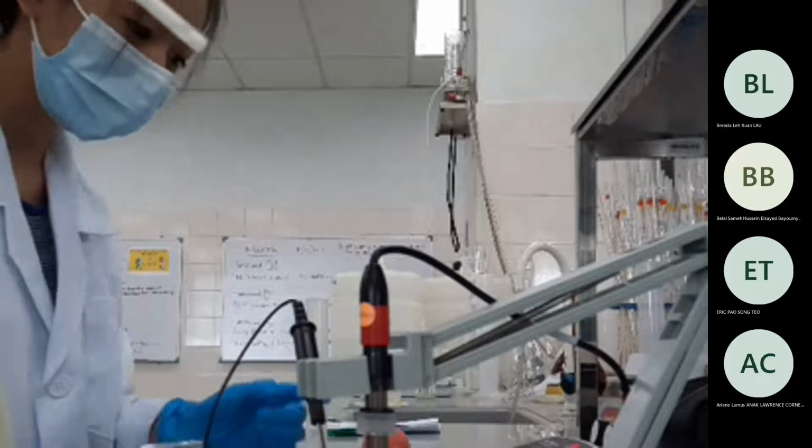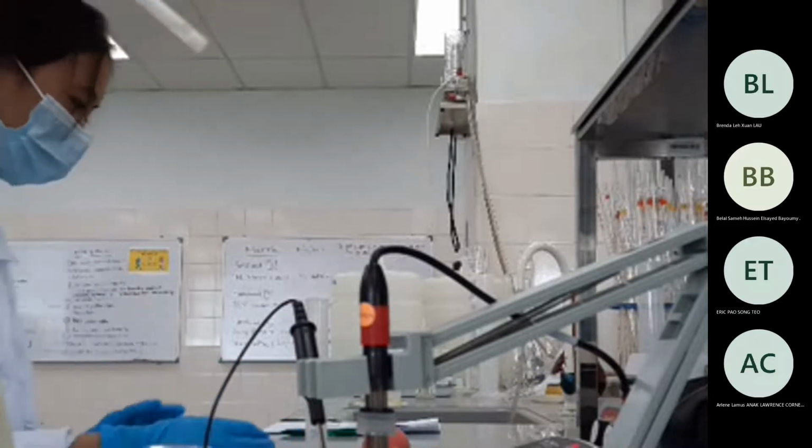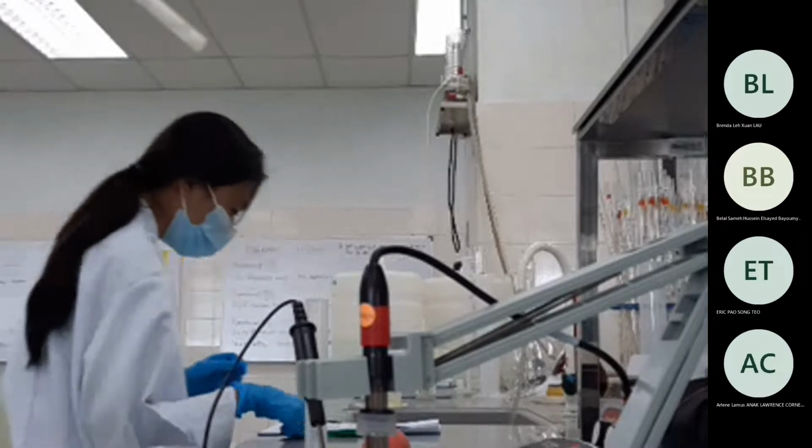Tap water. That's 3.3. Yeah, should be okay. It's not changing much.